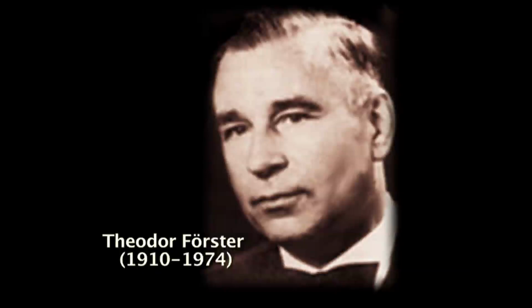The next assay which I am going to discuss is fluorescence resonance energy transfer or FRET, which is also known as Förster resonance energy transfer, depending on the person who actually invented it.